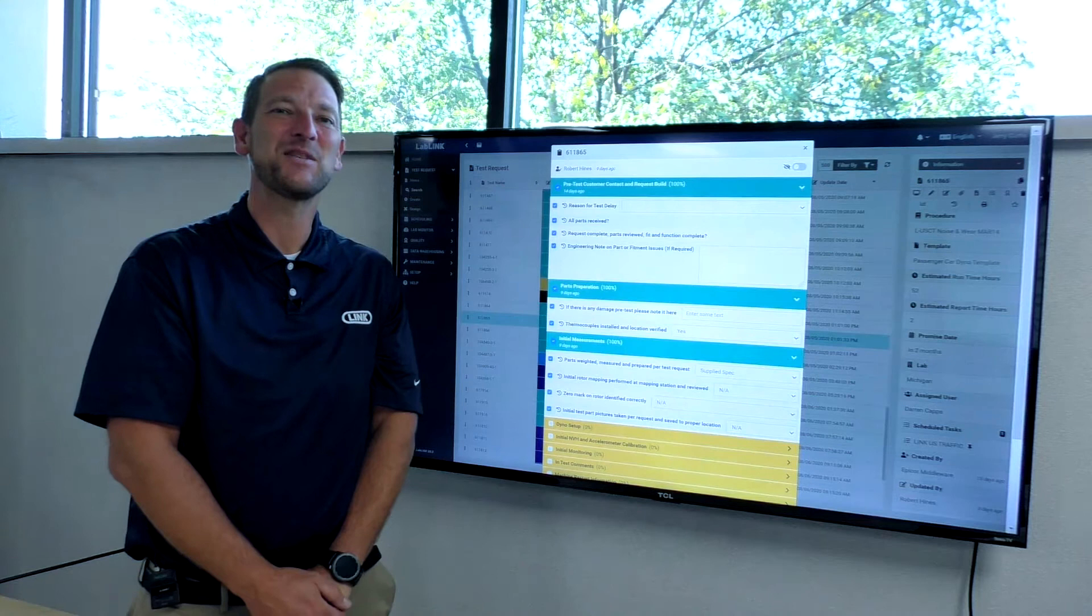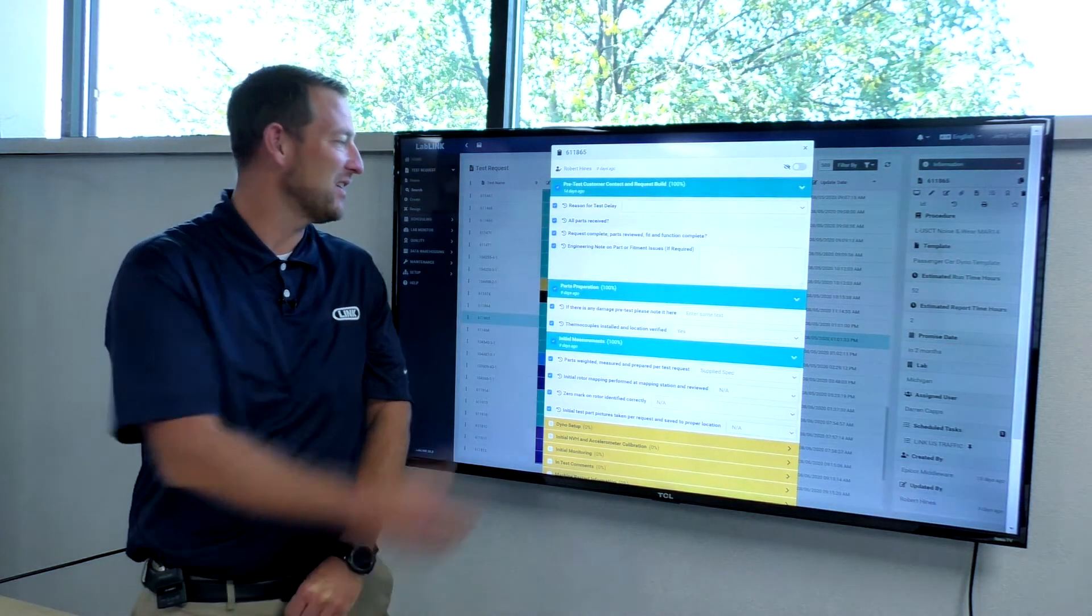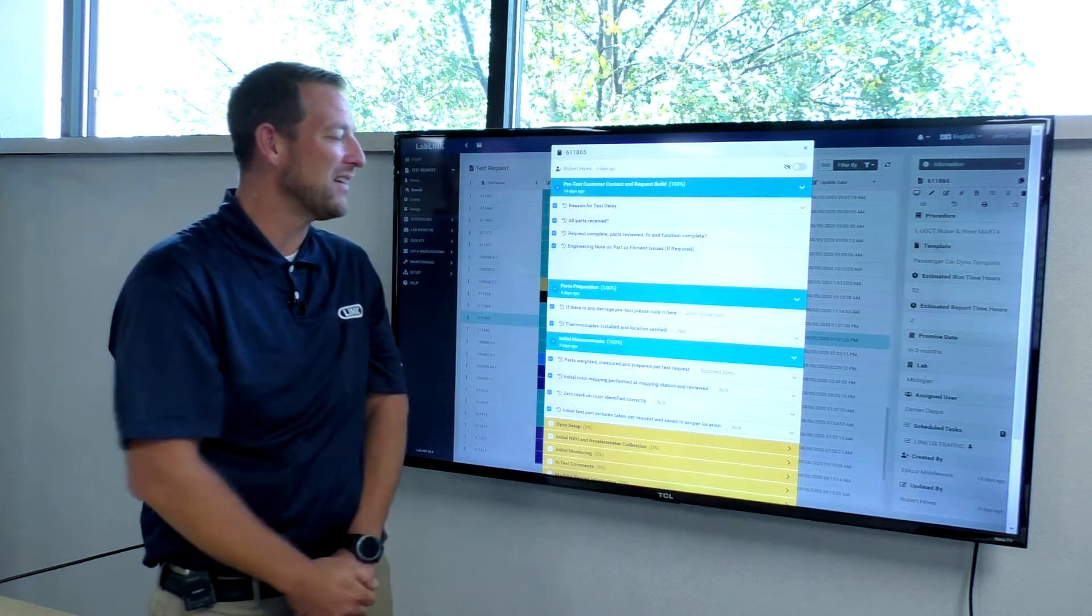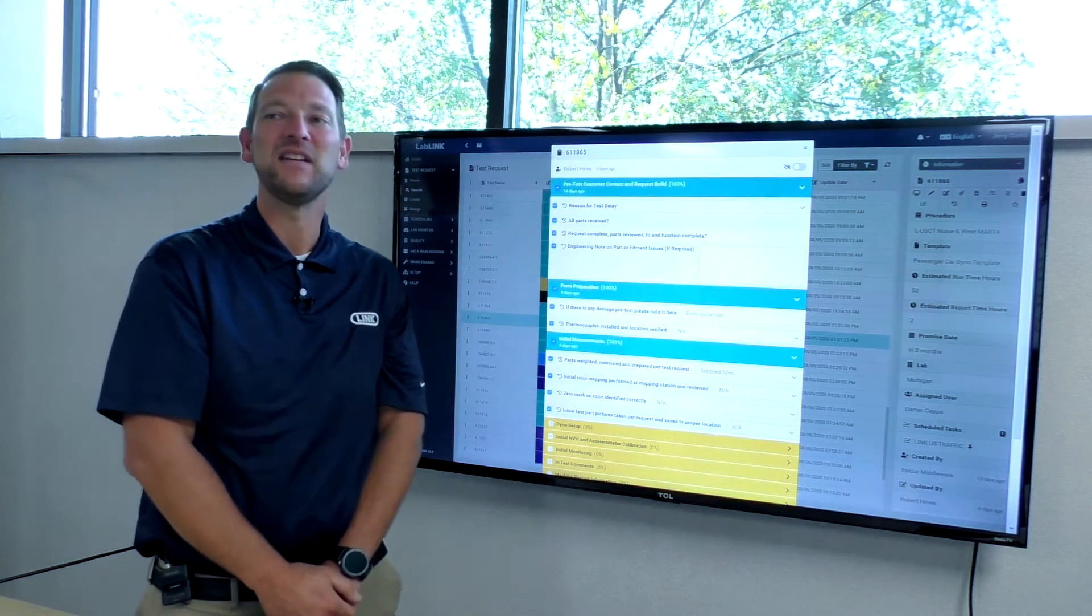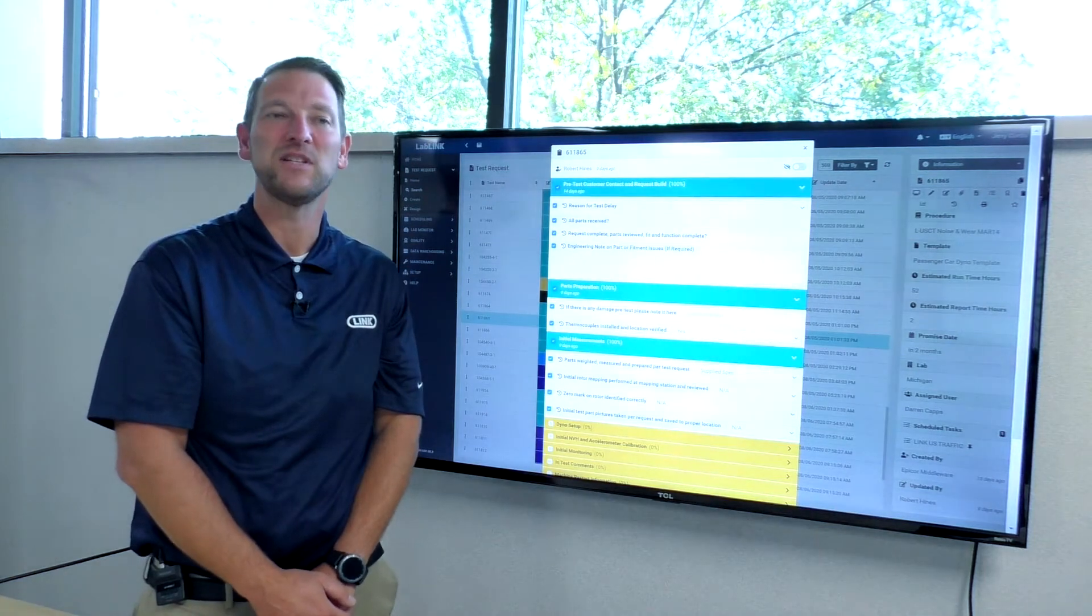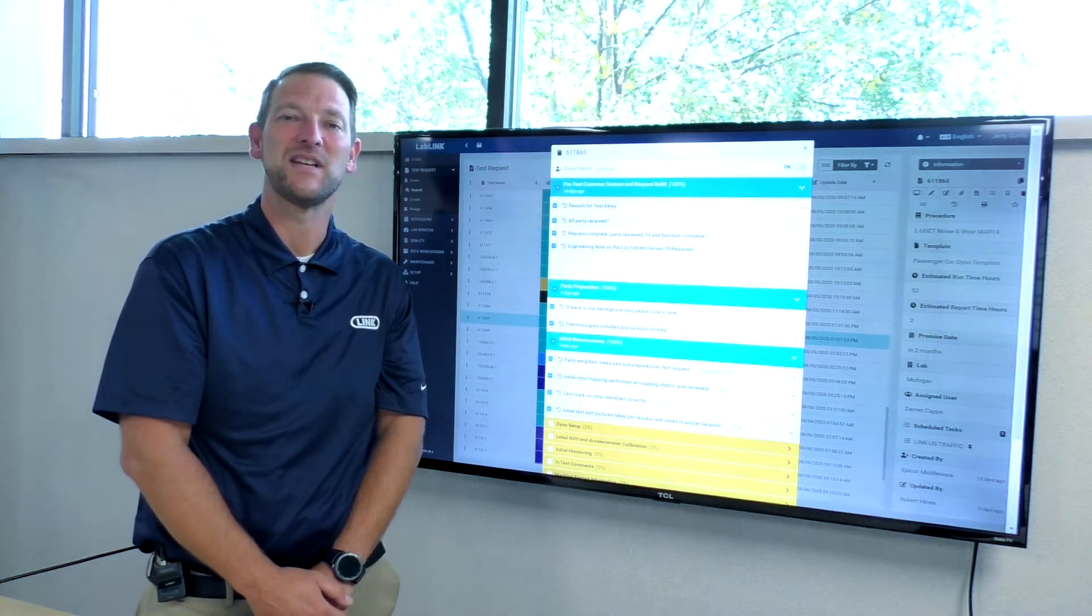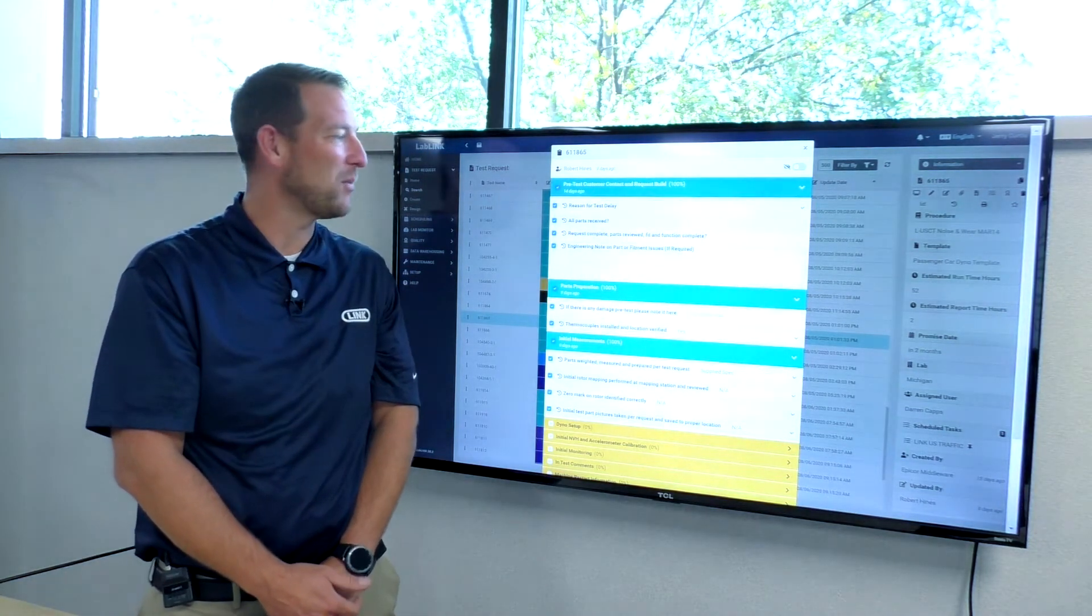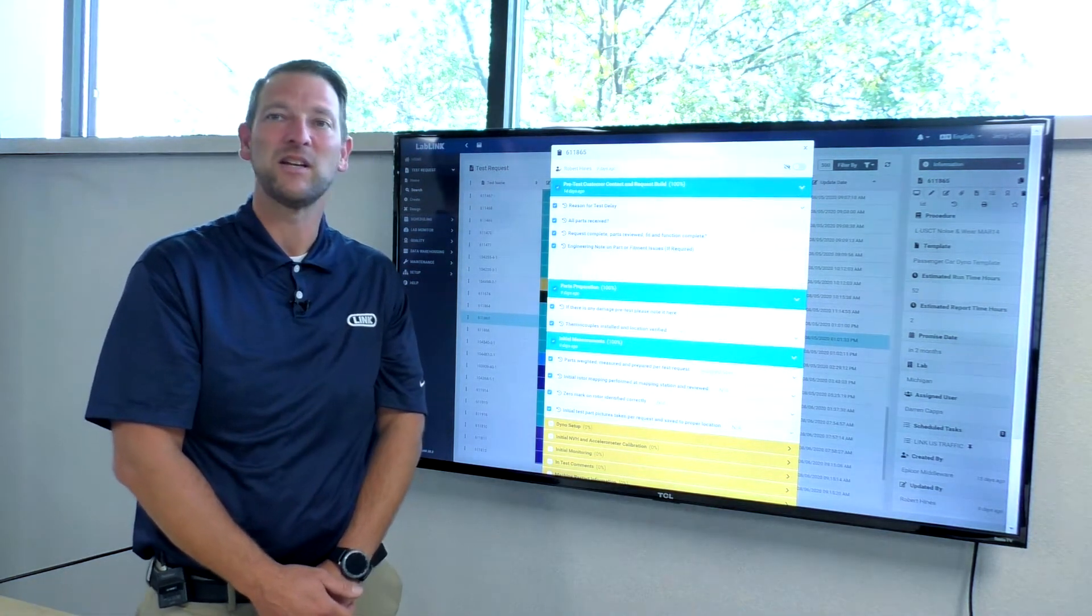Customizable digital checklists, like we're looking at here on the screen, eliminate the need for paper log sheets that are typically used in laboratory testing environments, and those require manual entry at a later point.